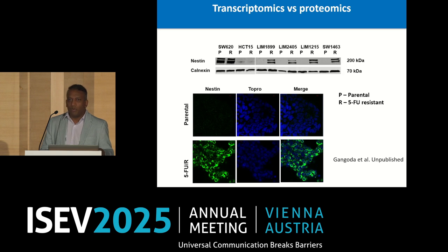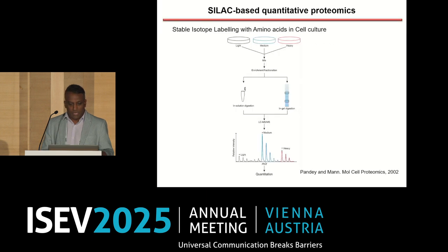If you have not found any protein in your mass spec, it doesn't mean it's not there, right? So there are multiple reasons why it is not there. Your antibody may work. Just go ahead and throw in the antibodies that you have on your prep. Just because mass spec didn't find it, it doesn't mean it's not there.